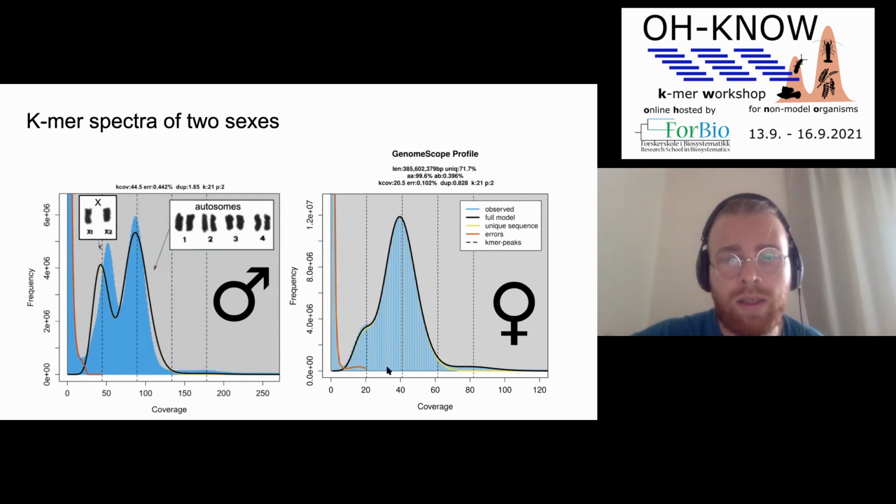So here the model fits a lot better than in the male, and all those monoploid k-mers are really representing the genome, the heterozygous loci. So both the genome size and the heterozygosity were estimated. I have about 10 more female individuals sequenced, and all of them are converging around the same values. It's always 0.3 something.